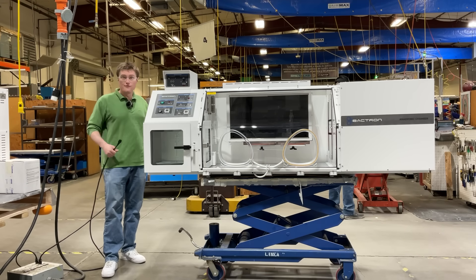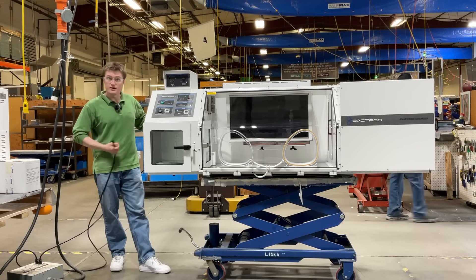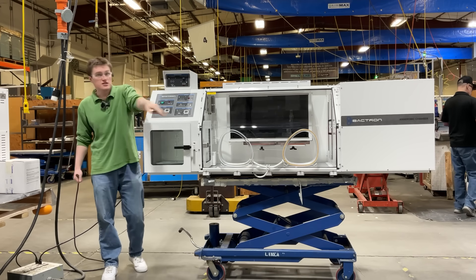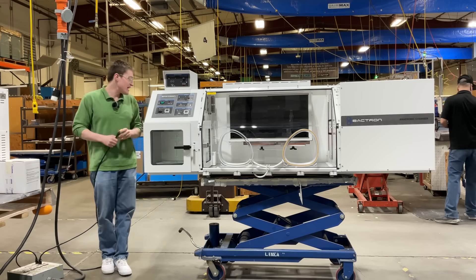Also located on the rear of your unit is an externally located fuse holder, as well as a foot switch connection. This allows you to operate the sleeve cycles while you're in them, hands-free.